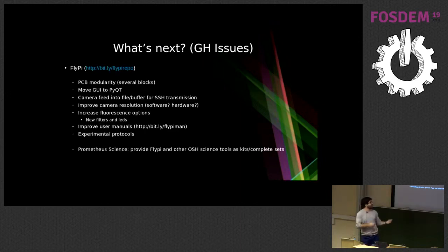What we want to do is basically communicate with the people that are producing these things and become quasi the middleman in between researchers that are publishing open source hardware and the users on the other side. So we want to take all of the work of certification, documentation, customer support, and provide this as a service for researchers and users of these devices. If this is going to be working, is still to be seen.